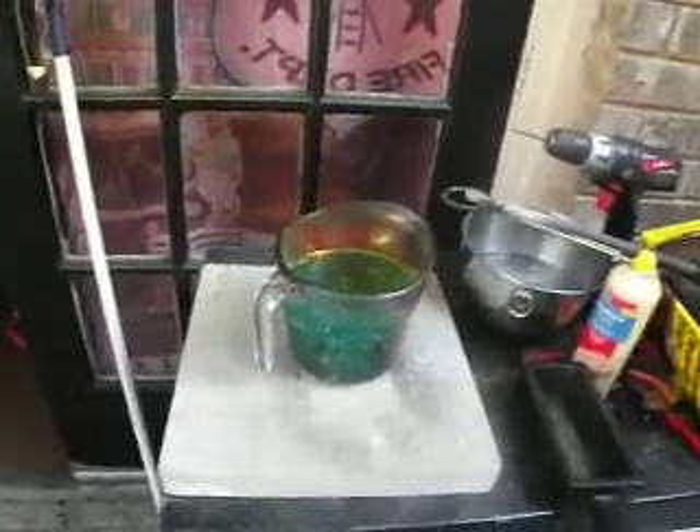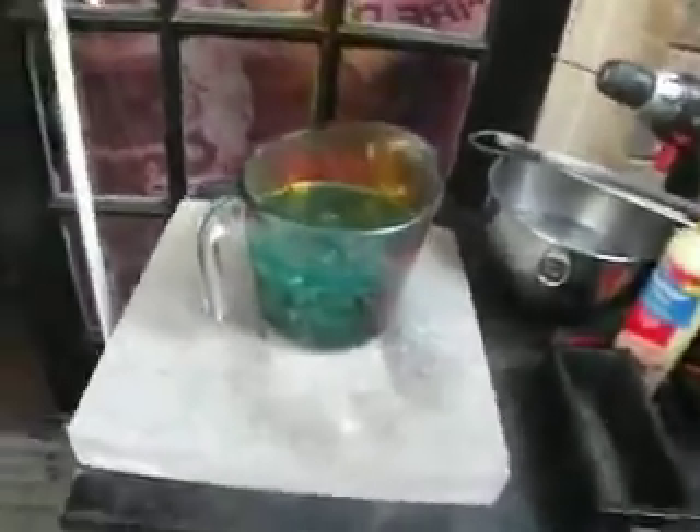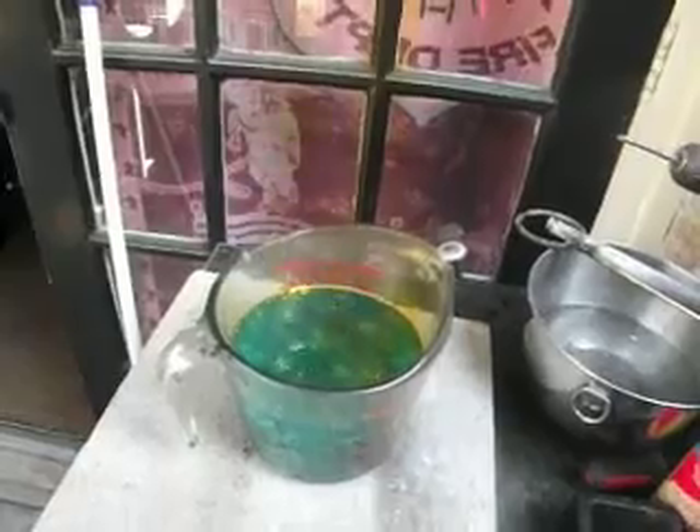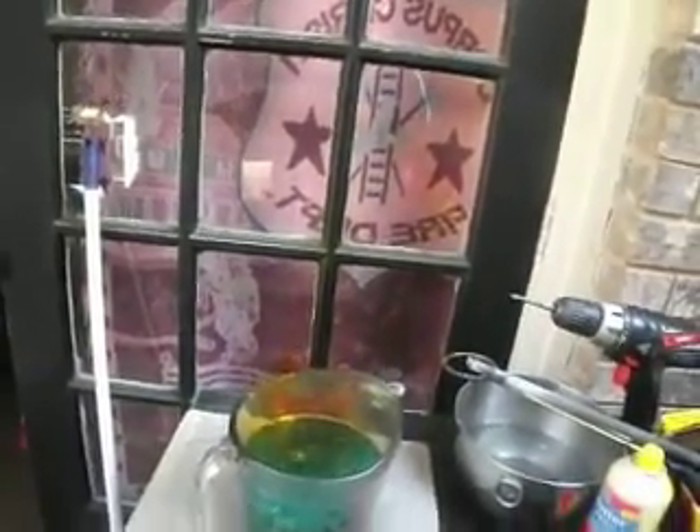I got my gold fingers sitting in my nitric right now. See it bubbling? That's getting the foils off. You can see the gold foils sitting on top. Those red fumes — you shouldn't really be breathing those in.